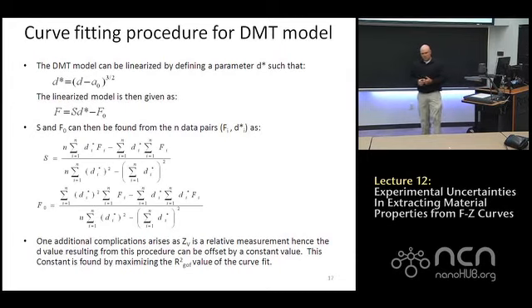So, curve fitting procedure. We have our equation. If you think back, it was F equals S, D minus something to the 3/2 minus something else. Really, if you're going to curve fit something, it's much more convenient to curve fit a line. The line is the simplest thing to curve fit.